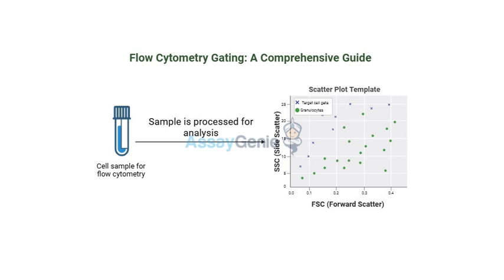They're like setting up a control experiment for each color. We take a sample that has all the antibodies except for one. So like we have a green, red, and blue panel. We'd have 3 FMO controls, one missing each color. So we're testing each color on its own to see how much it spills into the other channels. Exactly. And this tells us how much signal bleeding is happening. And that lets us correct for it, make sure we're interpreting the data correctly. So FMO controls help us separate the true signal from all the background noise. Exactly. They're super important for getting accurate data, especially in these complex experiments where we're using multiple colors, and spillover can be a big issue.